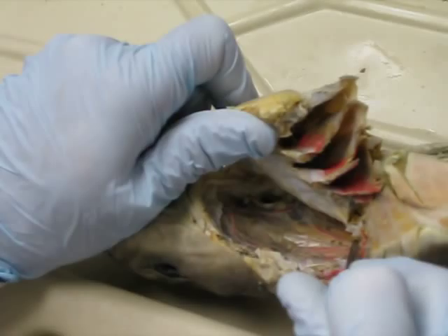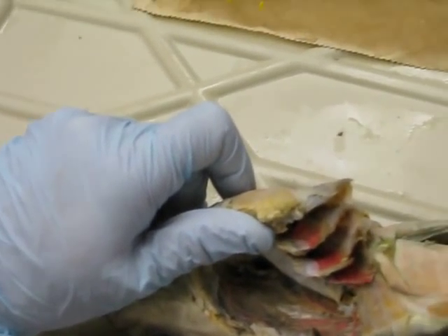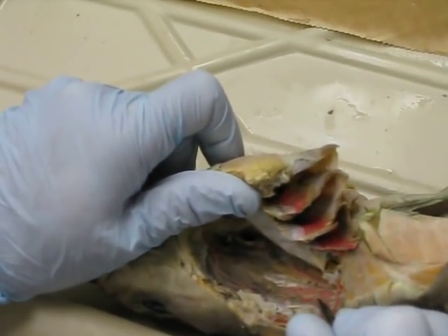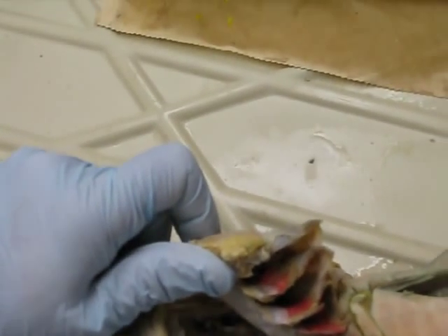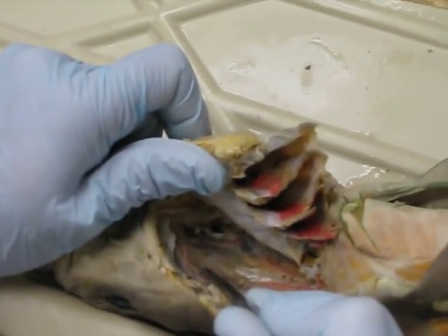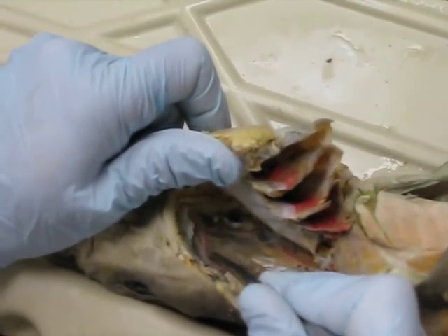Here we can see our efferent branchules, which are coming off the dorsal aorta. There'll be a blood vessel running at a different angle than the efferent branchules, and that's the esophageal. We see these two vessels here looking like one. This vessel here is the hyoidian epibrachial, and then continuing on towards the midline will be the internal carotid.